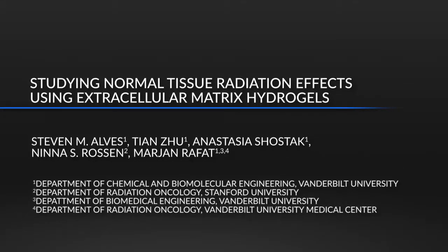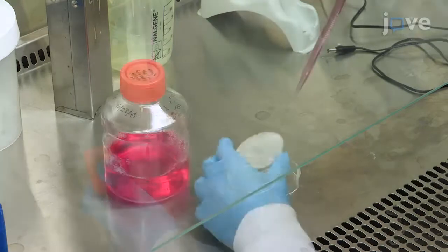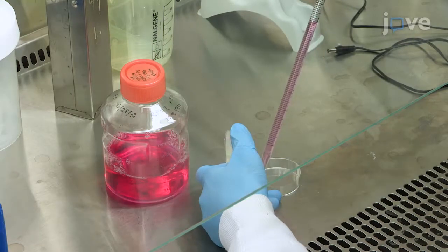This protocol shows that radiation influences extracellular matrix properties of adipose tissue in a murine mammary fat pad. The addition of radiation in a decellularization model has not been done before. This technique uses several washing steps that each serve a unique chemical purpose in the decellularization process.